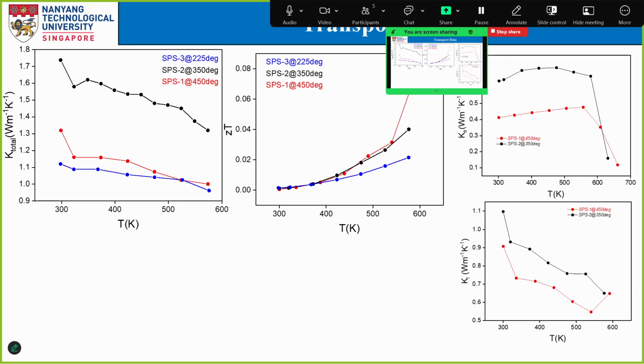It doesn't matter so much for electrical, probably. Electrical conductivity may change because your grain sizes might go up if you use a higher temperature for SPS; you get slightly larger grain sizes, and maybe your conductivity goes up a little bit. But thermal conductivity should be measured on a fully dense sample. Otherwise, it's artificially low. That might be the reason why you're getting this negative value. It might not be some exotic physics. Yeah, that makes sense.